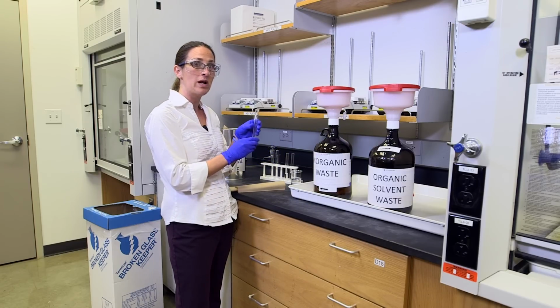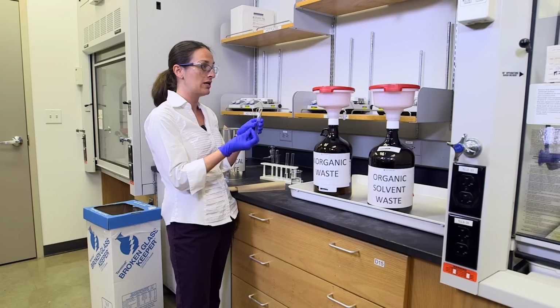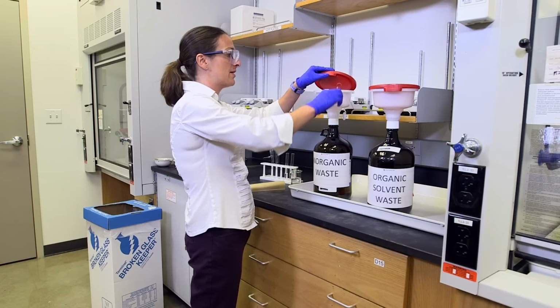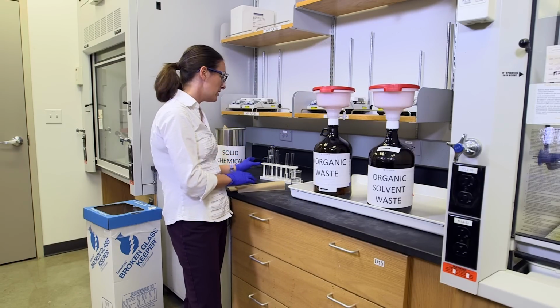So from 11, when I'm combining my strong acids and my strong bases, remember I get water and a neutral salt. Well, that neutral salt counts as inorganic waste. So even though it's mostly water, I'm going to put it in my inorganic waste because it has some metal salts.